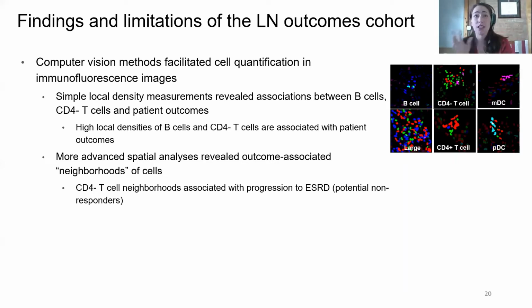It generalized pretty well, specifically the lymphocyte network. That was much better because the baseline performance was so much better. I don't have that data here, but it's published in an SPIE proceeding, and it works pretty well as long as the same panel is used. If the panel is different and there's different tissue autofluorescence from the different laser lines, the performance goes down.